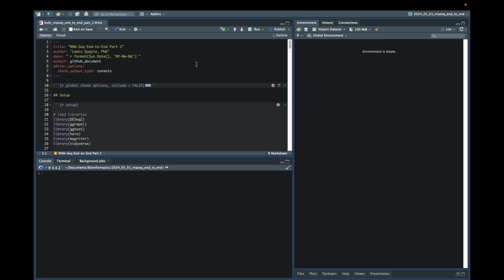The first thing that you're going to need to do if you want to follow along, and if you didn't follow the first part of this series, is to make sure that you've set up your project directory and installed R and RStudio. For those of you starting here, instructions for how to do those things can be found in the first part of this series, and you'll also need to download the nf-core output archive from the linked companion blog post for this tutorial.